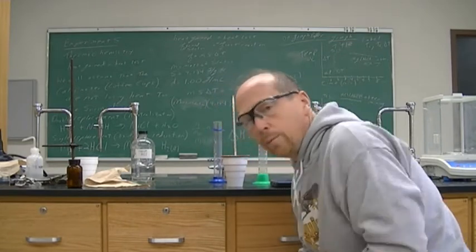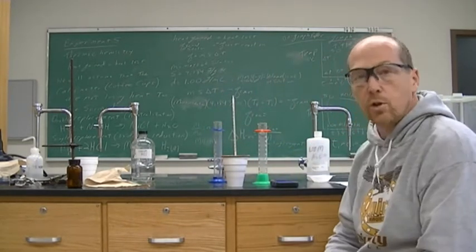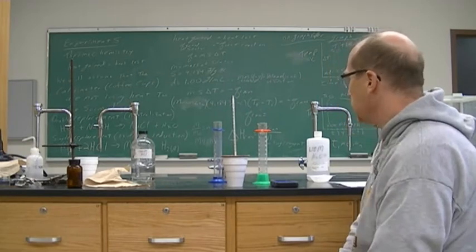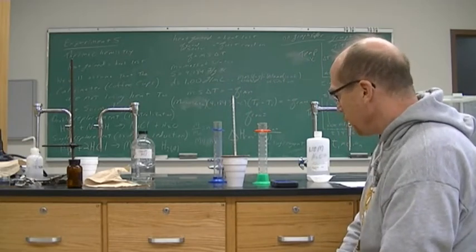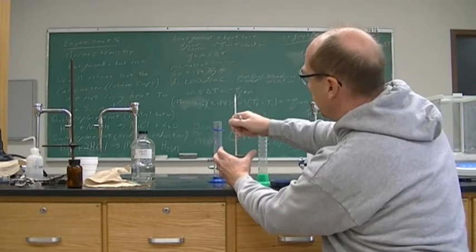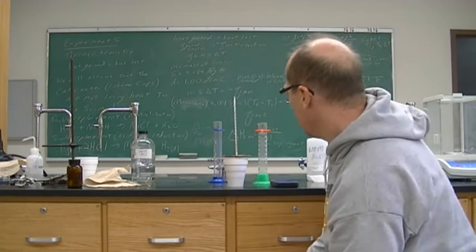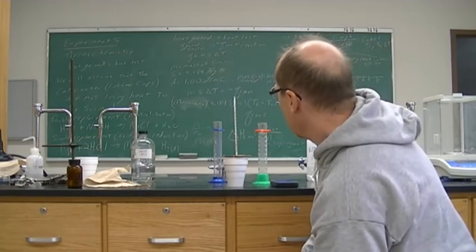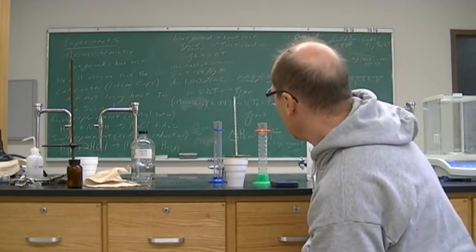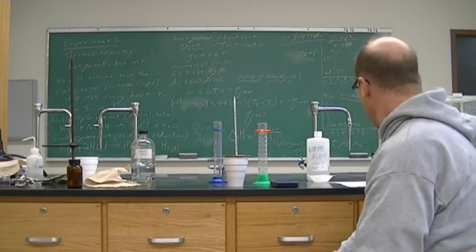It is still bubbling, it is still reacting, I can hear it, and the temperature is still rising. So we may have to go at this for a few more minutes before the reaction stops going and the temperature stops increasing. All right, it's not increasing as much as it was before.